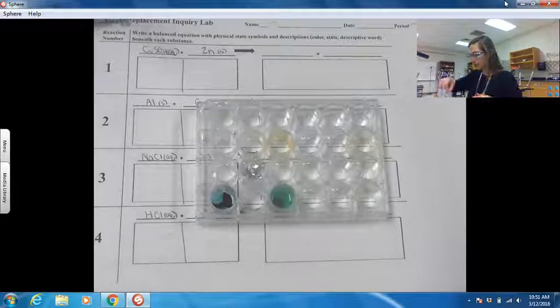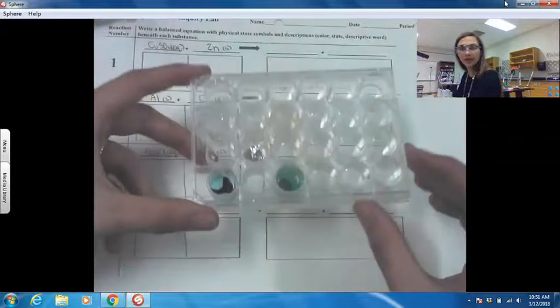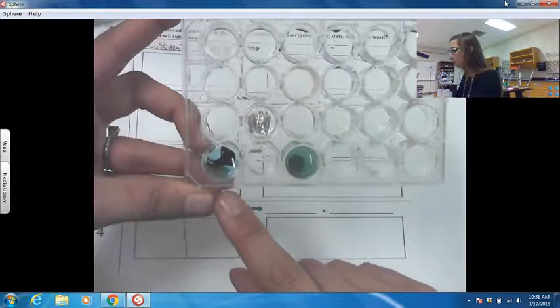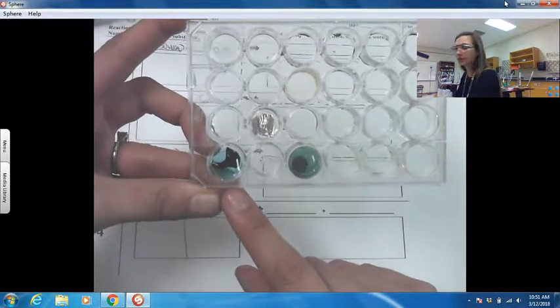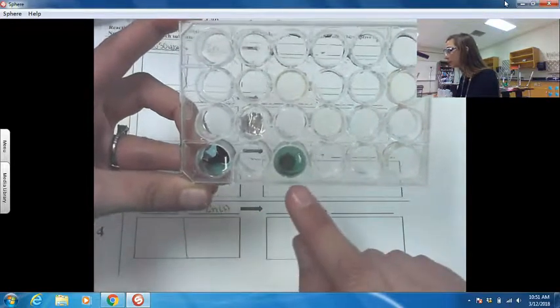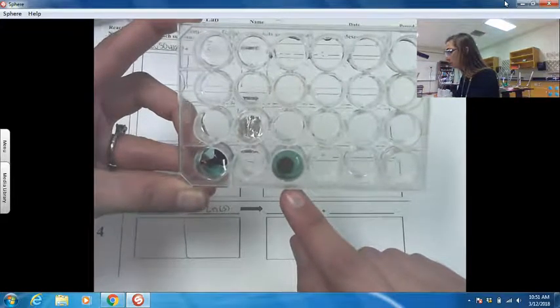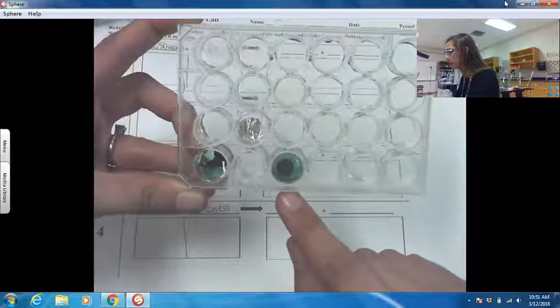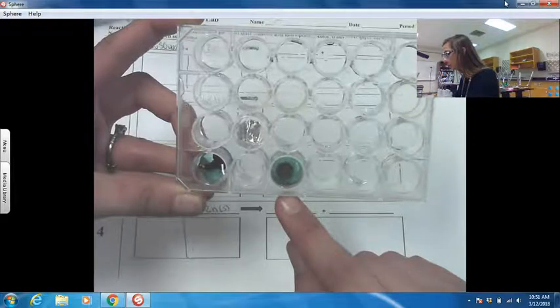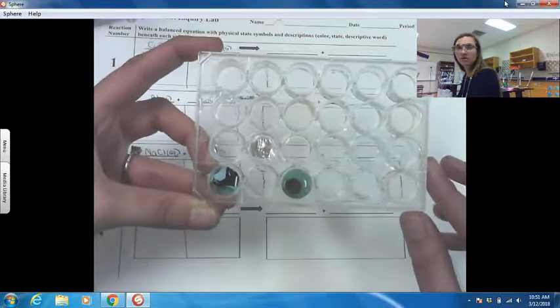And let's pause right here. Let's look at what's going on. Our zinc turned from that silvery metallic color to a really, really dark reddish orange color, red. Our aluminum in the copper chloride is now fizzing, and the solution is changing colors. It was once blue, and now it's greenish. And it looks like our aluminum is changing to a reddish color now. And it doesn't look like anything is occurring in our tin and sodium chloride.